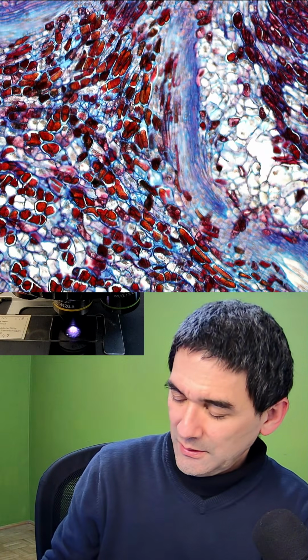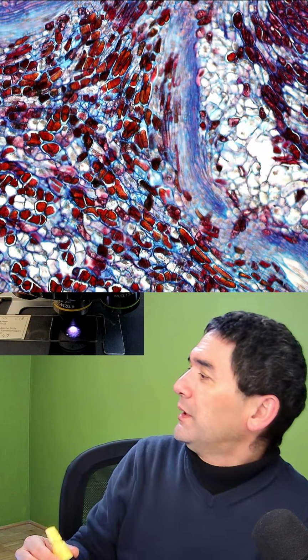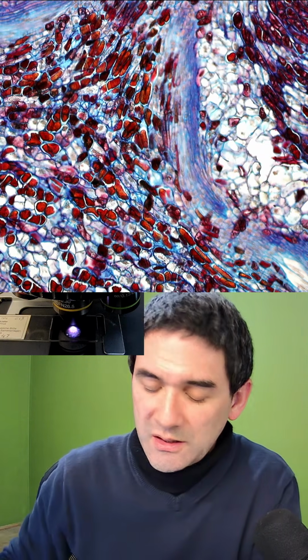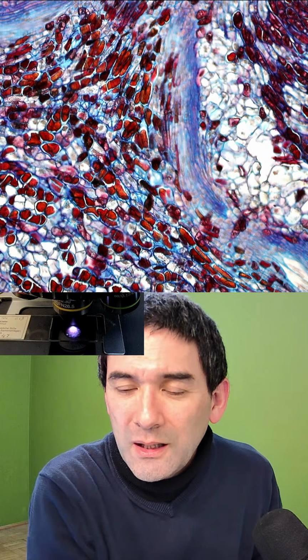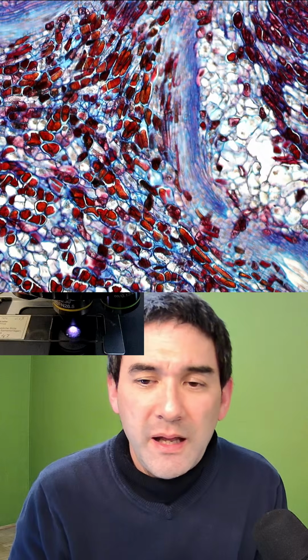That's the wrong one. That's the regular one. There is one with a green label called solvent free. So that's basically water based, and you can try. Refractive index won't be too important. Correct. Experiment, I would say.